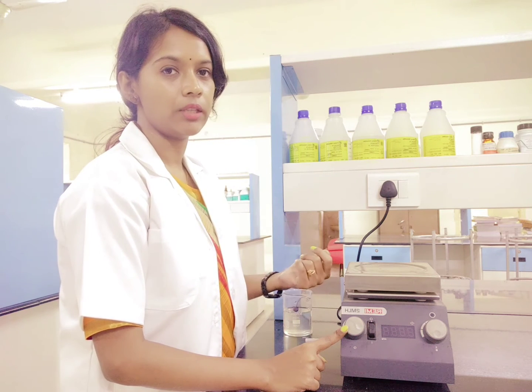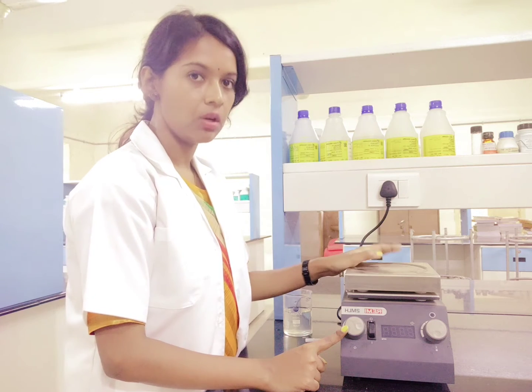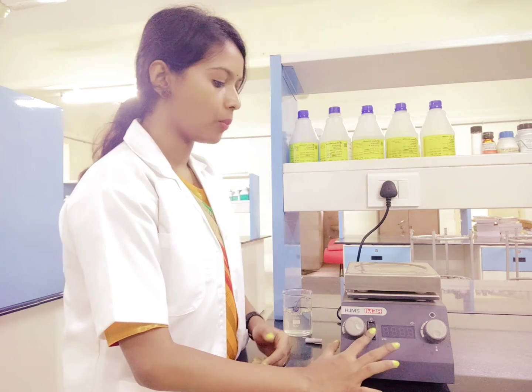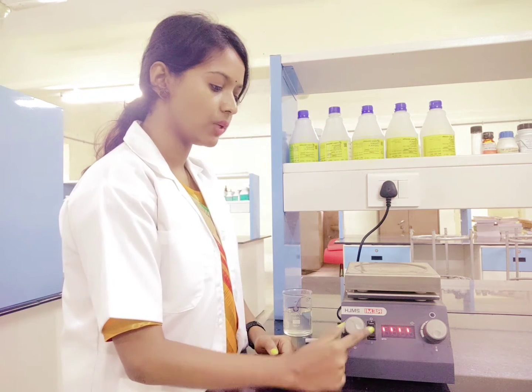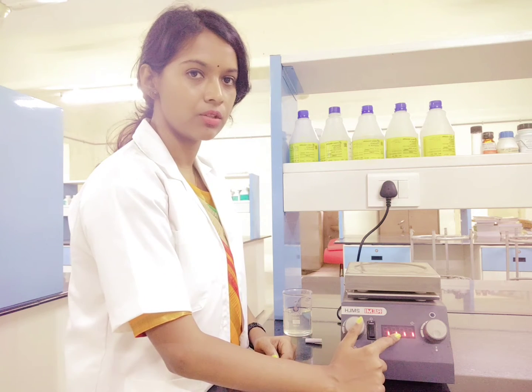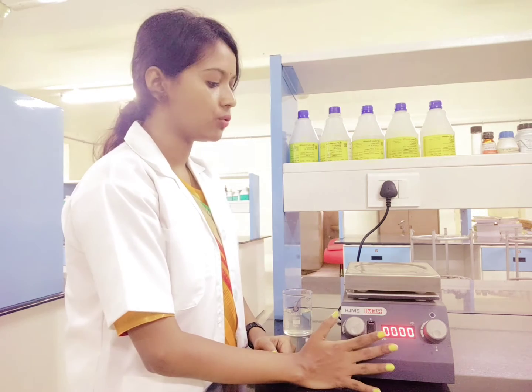Apart from that you have this regulator which is for speed, so that the stirring effect you can have in the sample that you are keeping in this instrument. Now let me show you how it operates. First thing is it is having a switch, so once you turn it on you will see that this display unit is getting turned on, and once it turns on you will know that the instrument is in a condition to use.